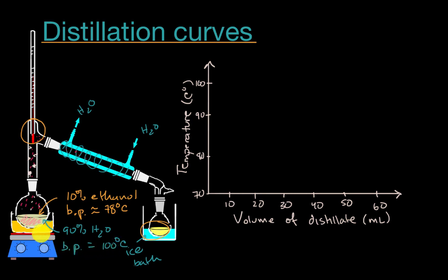And so if we're going to try to distill as much ethanol as we can, as pure of a sample of ethanol as possible, we're doing fractional distillation here, where as we start to increase the temperature of the hot plate and we try to get this solution to boiling, in theory, you'll have vapors even before you get to a boiling temperature. But to really overcome the atmospheric pressure and start to get a lot of vapors in here, you want to get this solution to boil. And then the vapors start coming up this column.